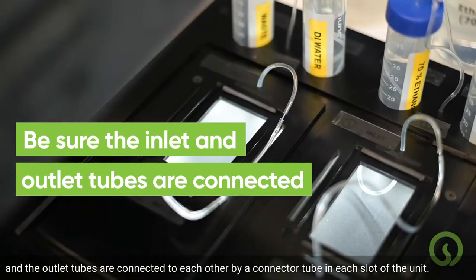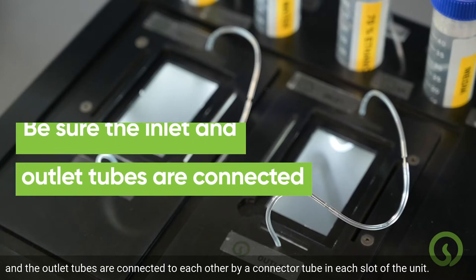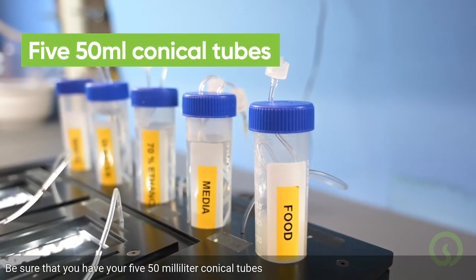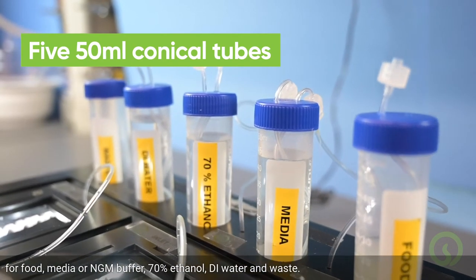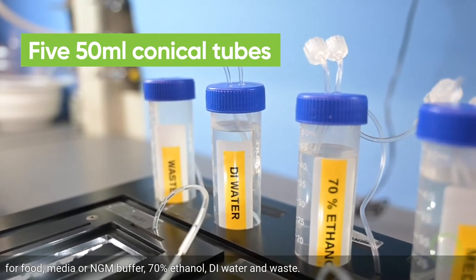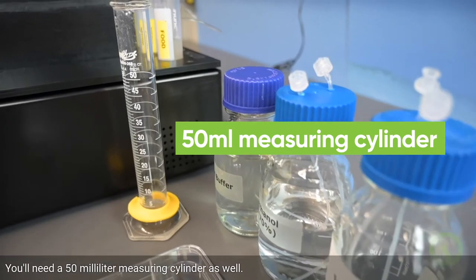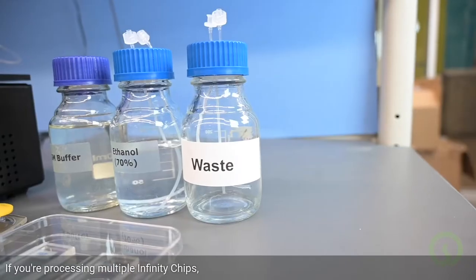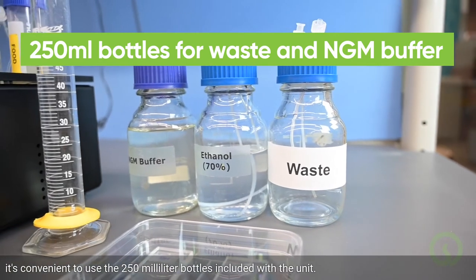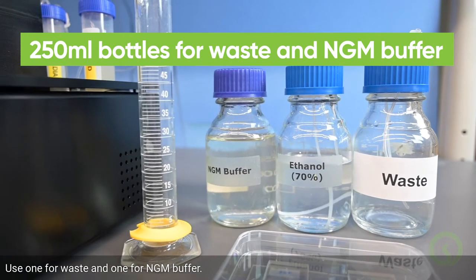Check to make sure that the inlet and outlet tubes are connected to each other by a connector tube in each slot of the unit. Be sure that you have your five 50ml conical tubes for food, media or NGM buffer, 70% ethanol, DI water, and waste. You'll need a 50ml measuring cylinder as well. If you're processing multiple Infinity chips, it's convenient to use the 250ml bottles included with the unit — use one for waste and one for NGM buffer.